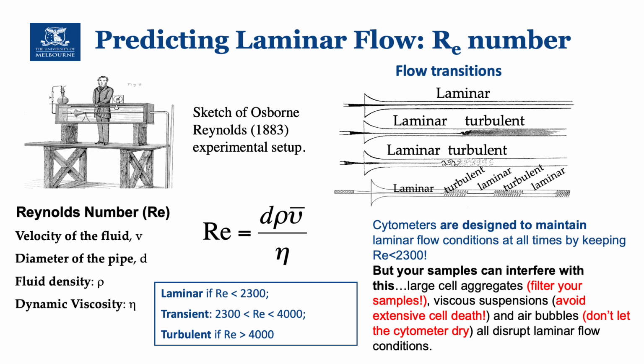The other thing that is very important is sometimes you can introduce air bubbles in the system. For instance, by leaving the instrument dry, which is something that we have seen quite frequently, specifically in nodes that are not directly supervised by staff. So air bubbles, air in the system, is the enemy of laminar flow conditions. It distorts the velocity and changes the quality of your measurements.